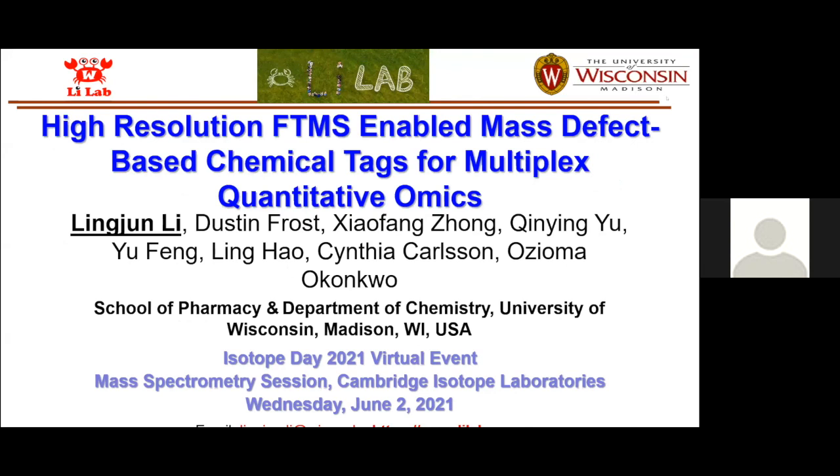Yes, we have. The CSF samples, though, were done by traditional LCMS methods because it's a technical thing. We got a new mass spectrometer. The old zip chip didn't fit on the front of the new one, so we had to buy a new zip chip, and it's not here yet. So we did it by LCMS, but fundamentally the CSF could be done by the zip chip also.